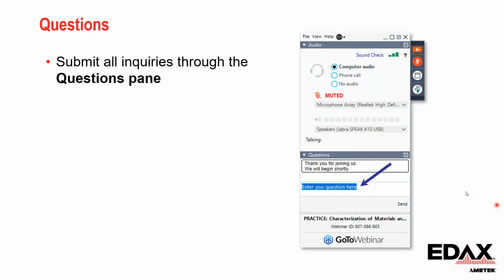This question is, how long is the scan time for WDS compared to EDS scan? In general, WDS requires longer time because for EDS, you get all of the peak information simultaneously, and for WDS, you can only do one element at a time, and it scans from lower energy to higher energy, so it takes a longer time.